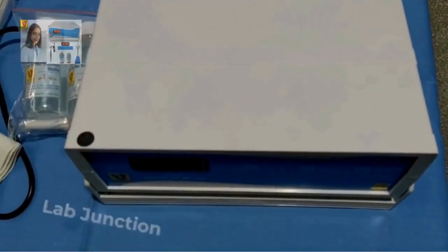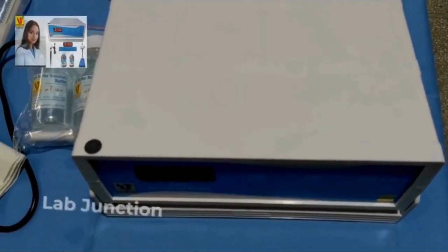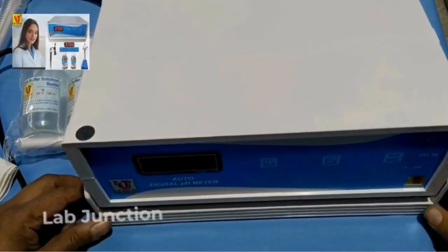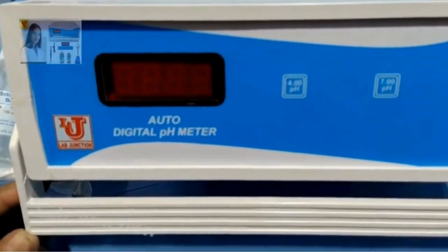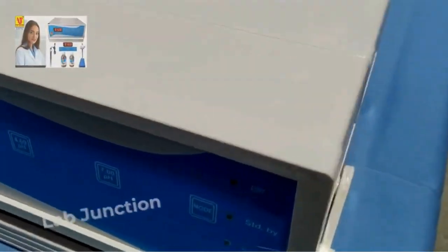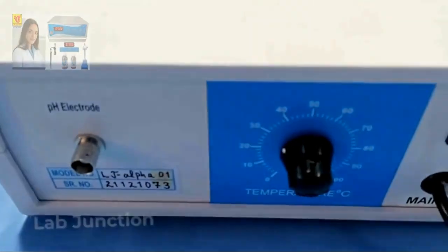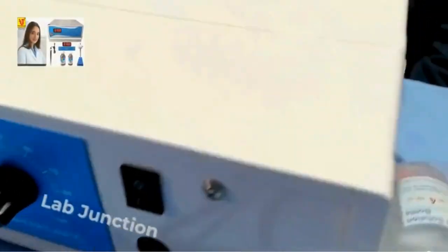Lab Junction's Auto Digital pH meter model LjAlpha01. This is our main instrument — here is the front view, side views, back view, and again the side view.